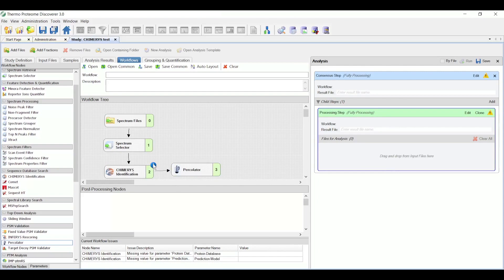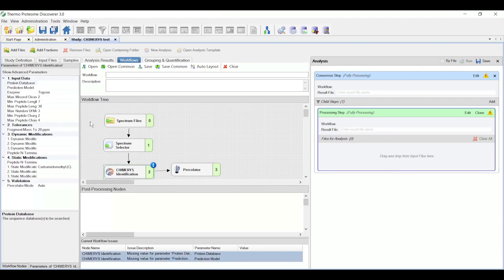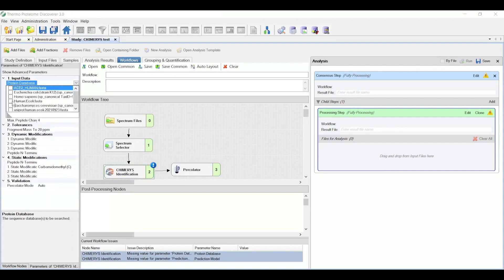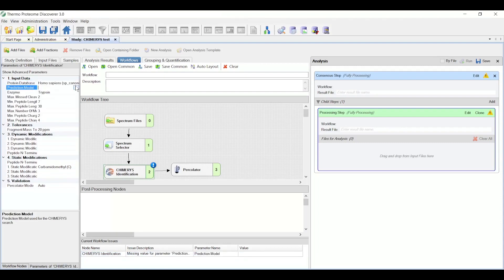So note there's a little blue checkbox. It means there are parameters in the node I still need to set. So here I open the Chimera's identification node. On the left, I need to choose my protein database. In this case, it's a human database. I need to choose the prediction model. This is actually made available from the service itself, and there's only one available prediction model.